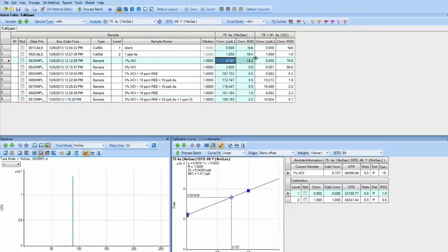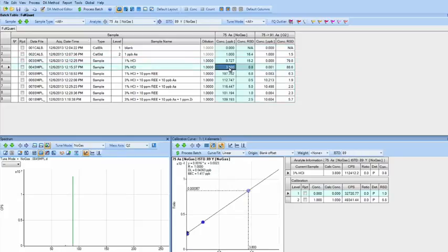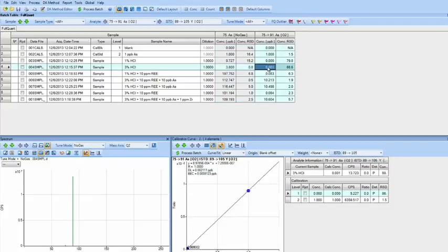So for 1% HCl in no gas, we get about 0.7 ppb showing up at mass 75. However, in the mass shift mode, in only 1% HCl, we don't see any detectable arsenic. When we go to 3% HCl, the 75 arsenic no gas gives us about 3 to 4 ppb, while in the mass shift mode from 75 to 91, we get 1 part per trillion. Now the more interesting modes.